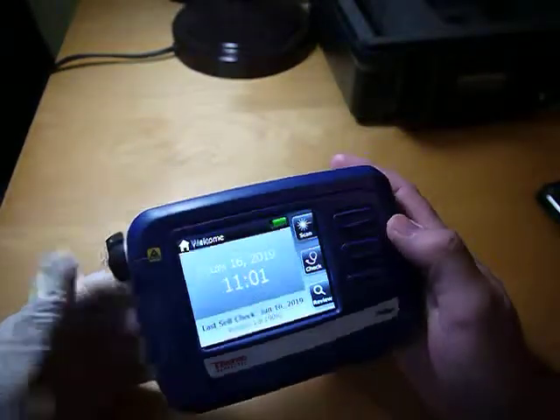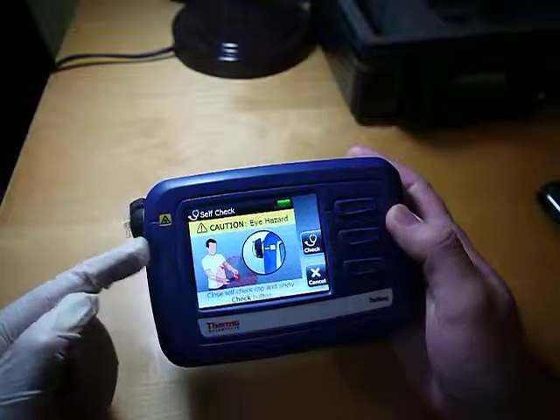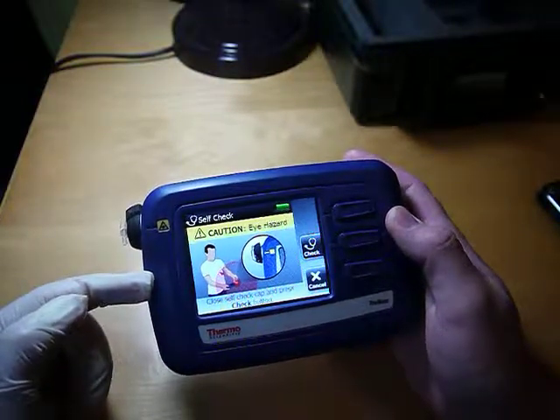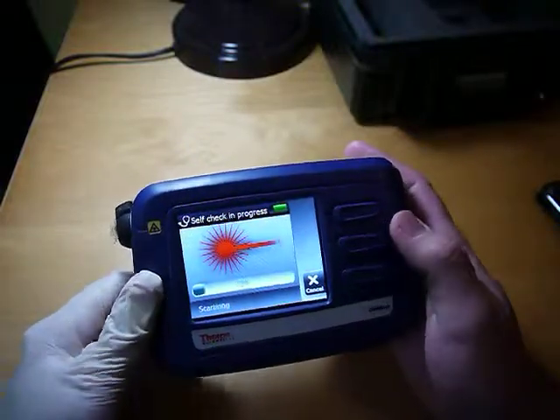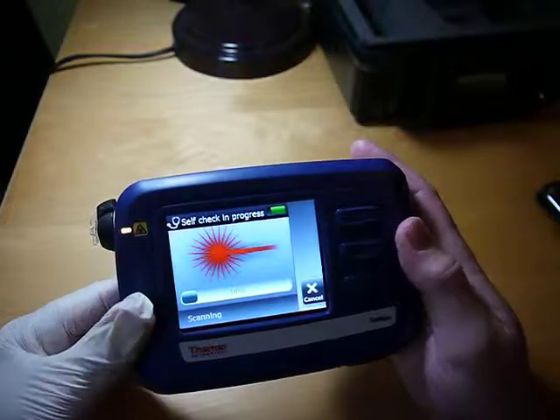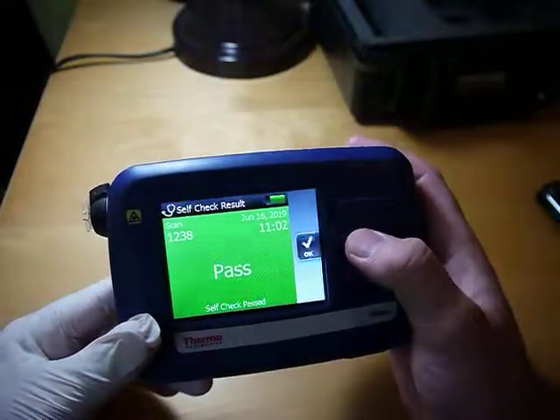It's accepted the code and it's giving me the date today. I'll do the daily check — I hit check and I've got this in place. You don't want to look at the laser, and this little cap is in place. I hit check again. Now it's firing into the plastic and making sure that everything's working correctly. I've got a pass, so I'm ready to start testing now.